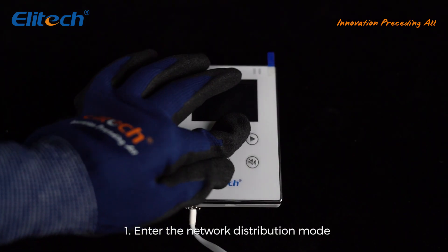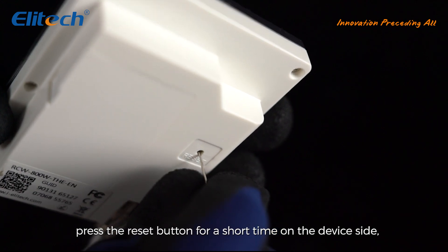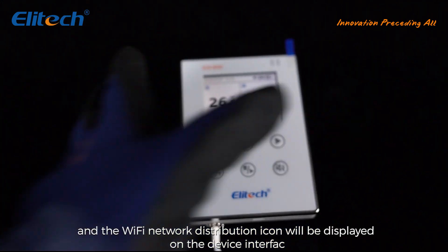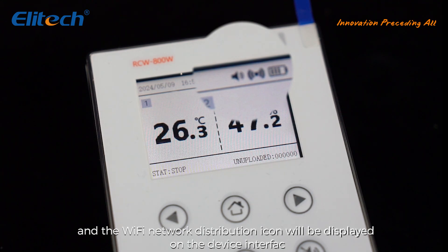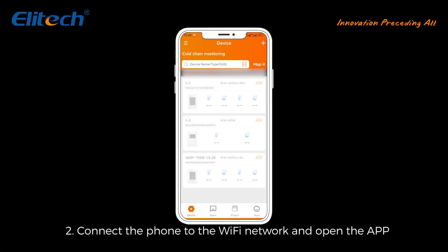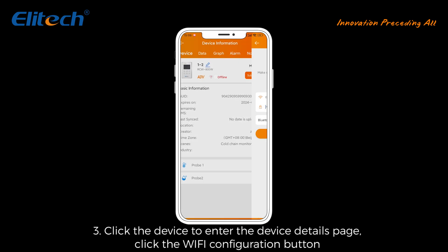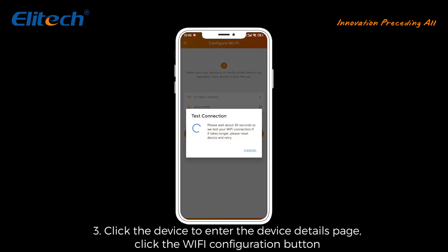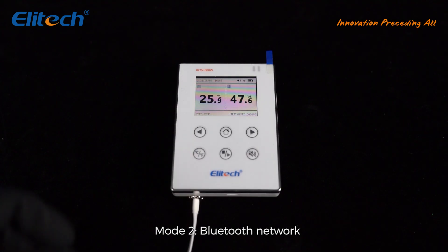Method 1 - Conventional network distribution: press the reset button briefly on the device; the Wi-Fi network distribution icon will appear on the device interface. Connect the phone to the Wi-Fi network and open the app. Click the device to enter the device details page, click the Wi-Fi configuration button, and enter the Wi-Fi password. Once connected successfully, the screen displays the network signal.